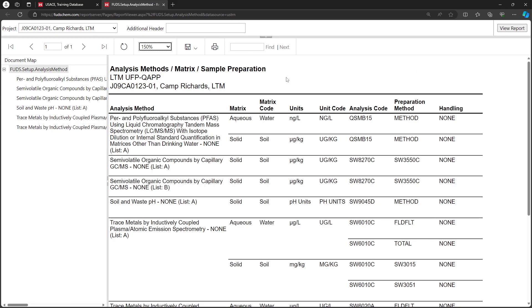The Matrix Code, Unit Code, Analysis Code, Preparation Method, and Handling columns contain the valid values that the labs should use in their SED files. This information comes from the Methods, Matrix, and Sample Prep tabs of the EQAP Setup tool.